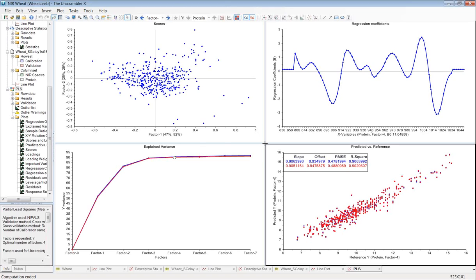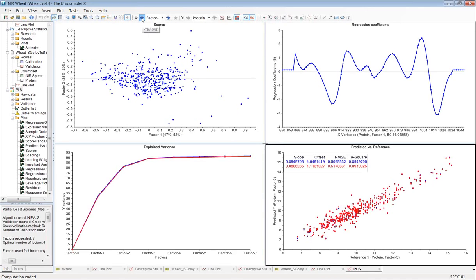That's just showing that this number with 4 factors is a little bit better in the numbers, and the RMSEs are a little bit better. But if you actually look at the difference between factor 3 and factor 4, you're not getting enough extra information from that factor to really justify including it. The fewer factors that you can use to explain your data or to do your prediction, the more robust your model is going to be in the future. When you start putting in things that look different, it's not going to be affected by that. And I'll show you some more tricks on how to figure that out.